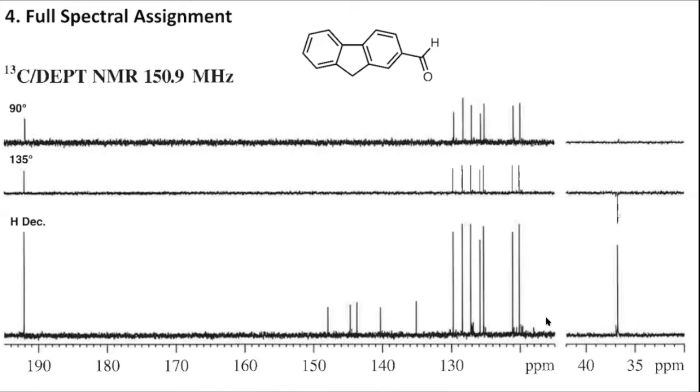So you'll see the 3 spectra that we've provided are the kind of quote-unquote normal proton decoupled experiment. That's just any average carbon that you've seen. And then we also have the DEPT information here for you, the 135 and 90-degree DEPT experiments to help rule in or out different types of carbons as far as their hydrogen count. So let's roll through all 3 of these together, and then we can start to look at the 2D information.